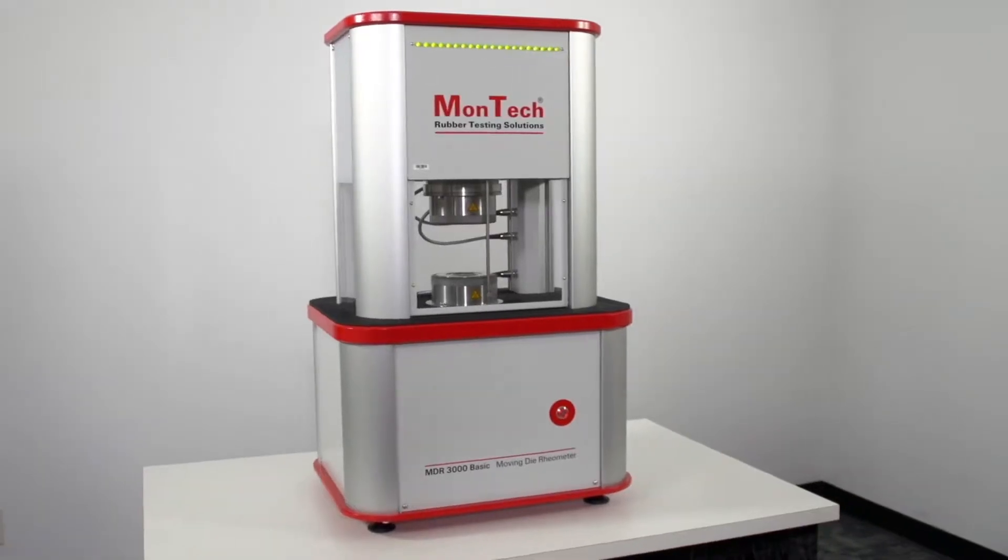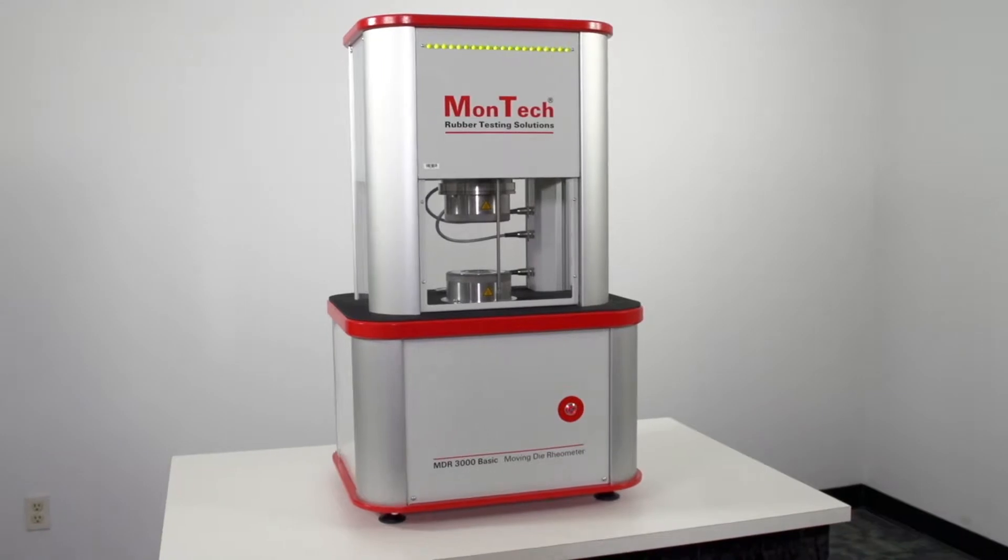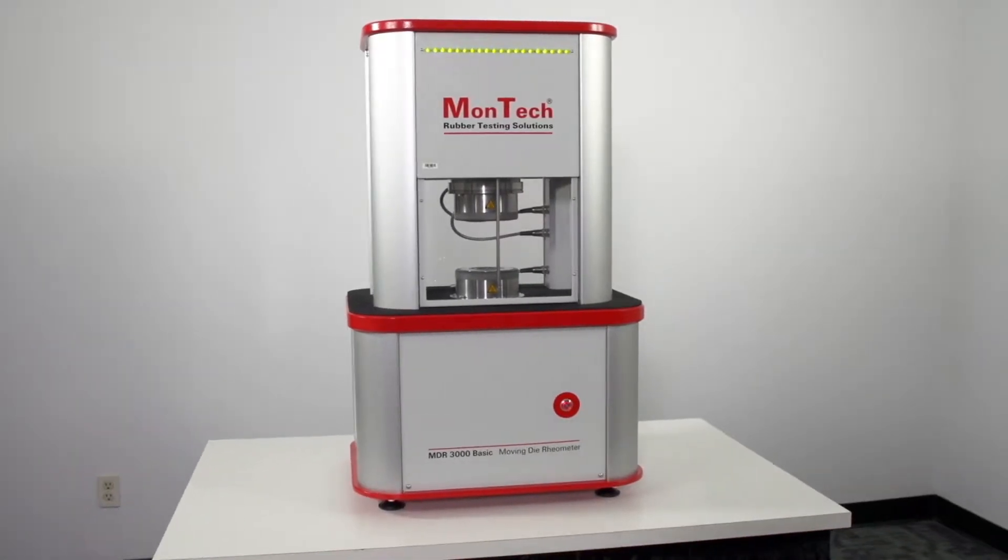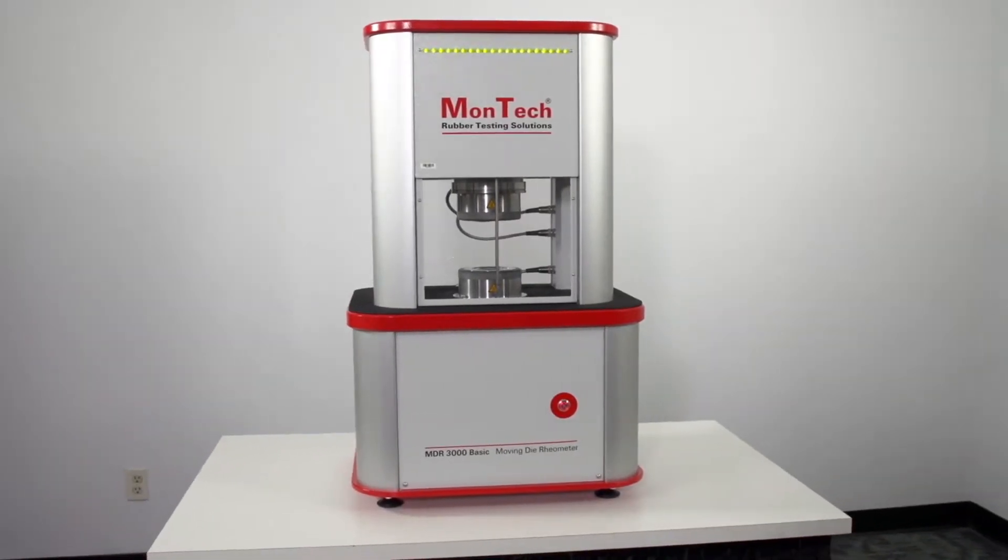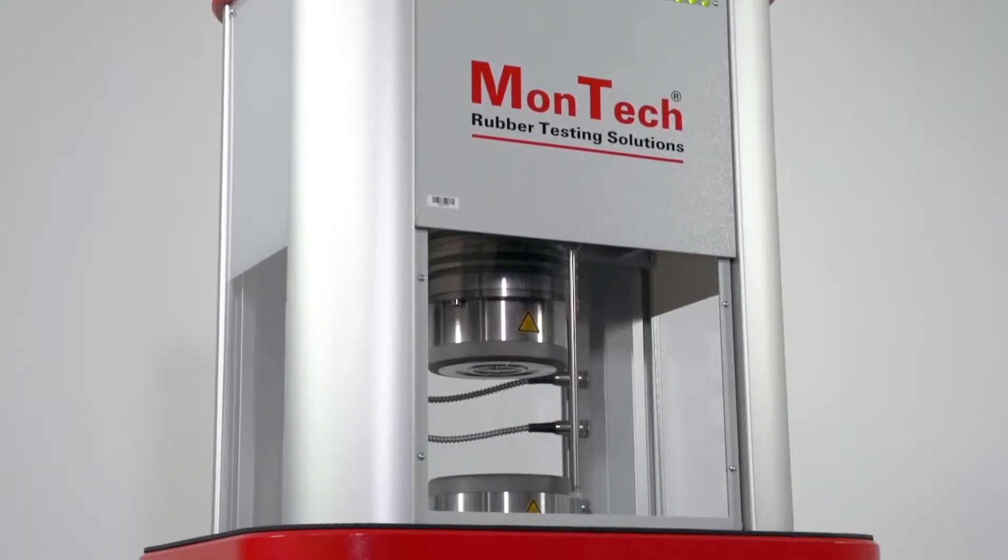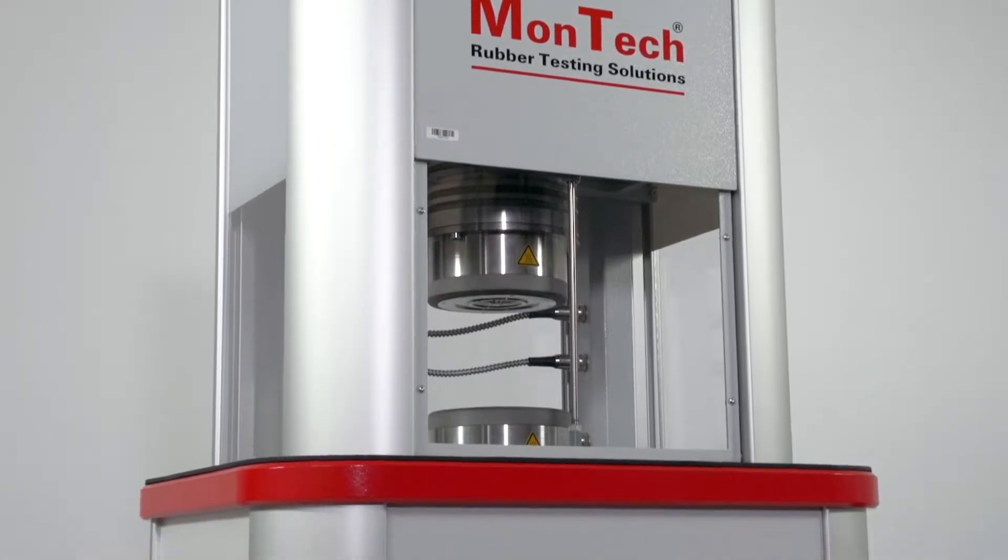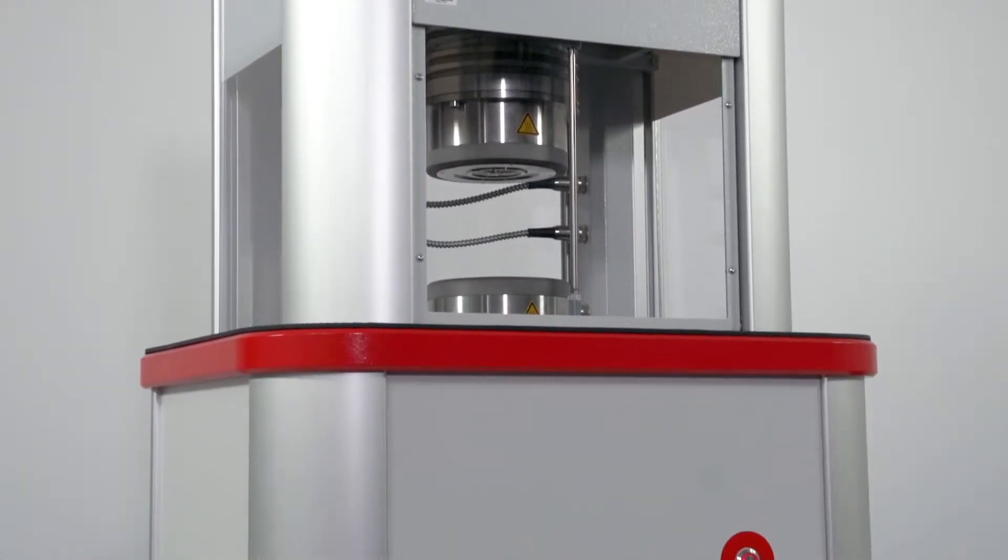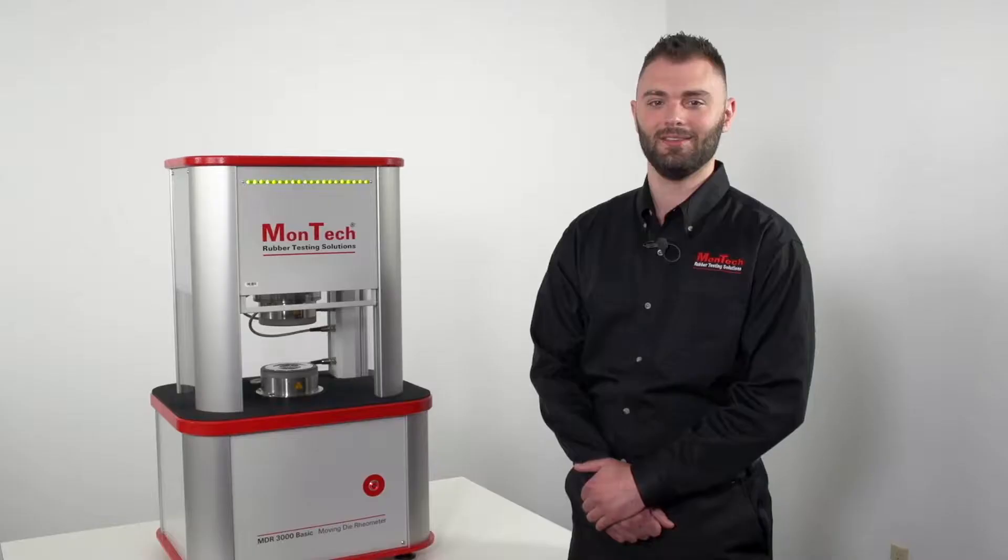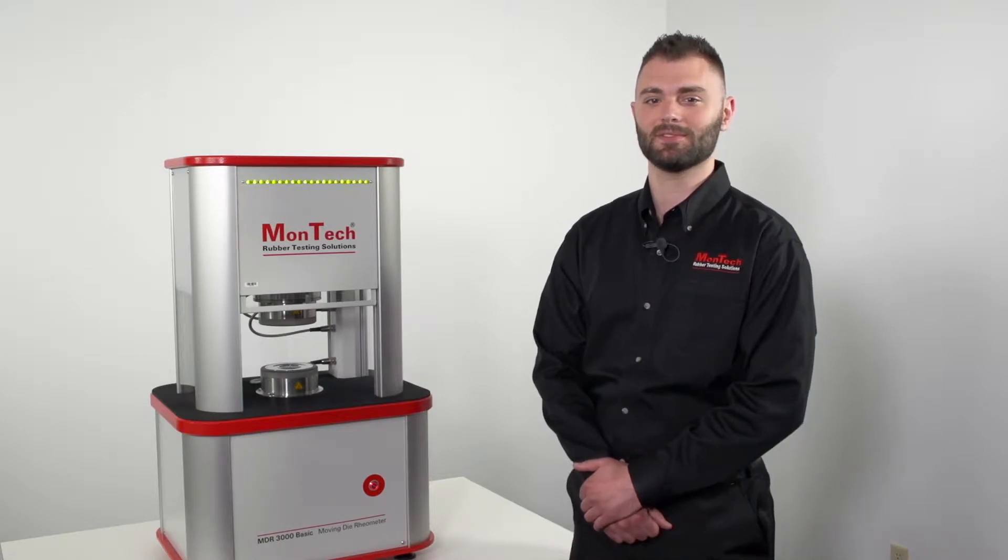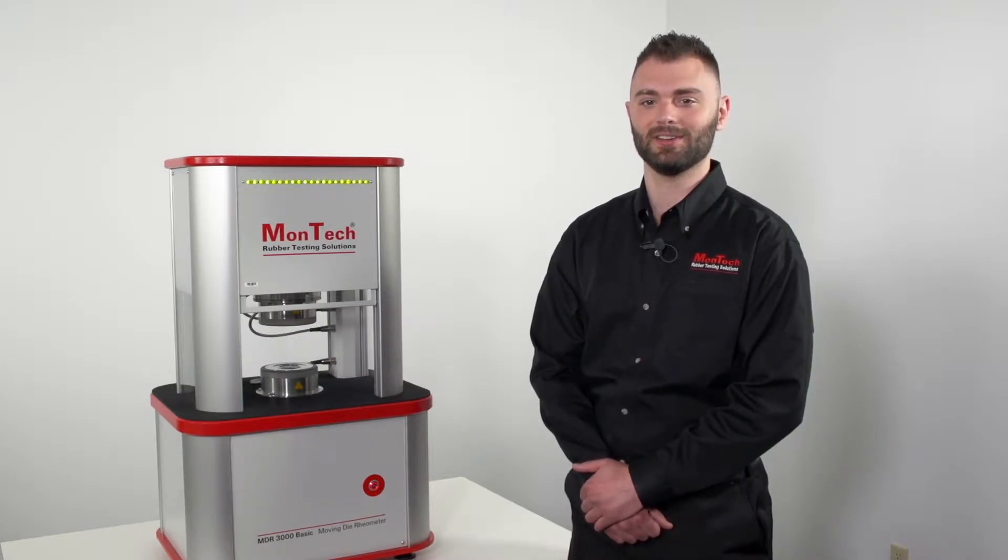The MonTech MDR3000 Basic Moving Die Rheometer provides the highest levels of precision and repeatability for measuring vulcanization properties of rubber and elastomeric compounds. The MDR3000 Basic performs essential tests for batch release or incoming compound verification.